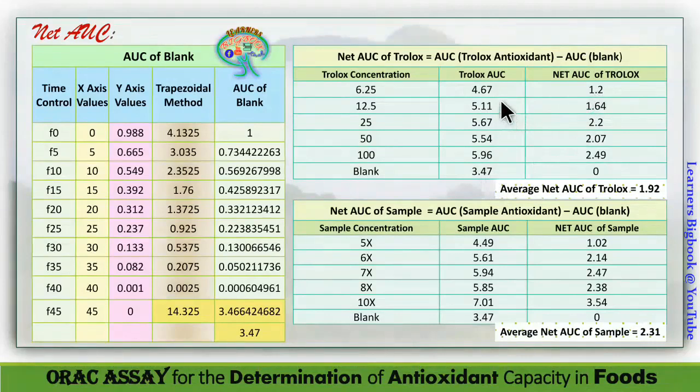When you come to the blank, it will be blank minus blank, that is 0.